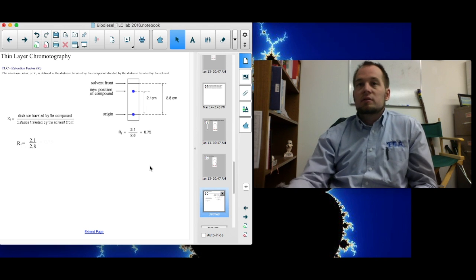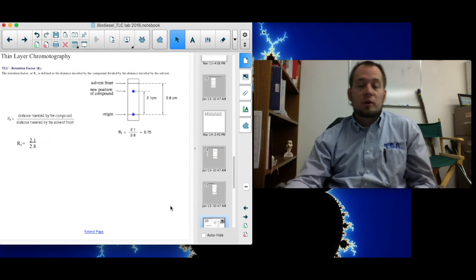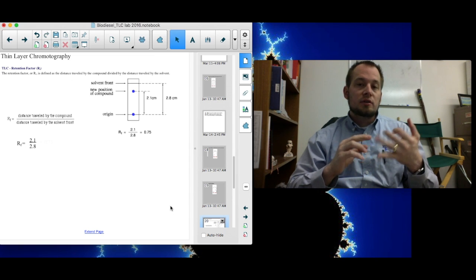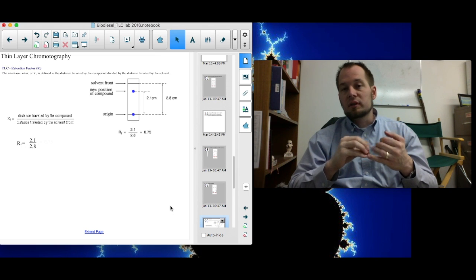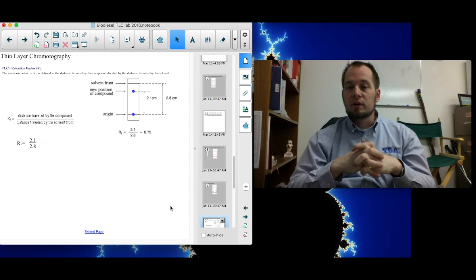But what you can then do is check, as I said, scientific information. Look for that 0.75 and see if that matches what other scientists get for diesel in hexane. All right, so just quick review. We talked about TLC, thin layer chromatography. The idea is to either separate out a mixture or determine the properties of a substance based on how far it moves. So to do this, we calculate the RF value. We take the distance the compound traveled, divide it by the distance the solvent front traveled, and that number is the RF value. You can compare it to other substances or check it against tables and charts that other scientists have done.